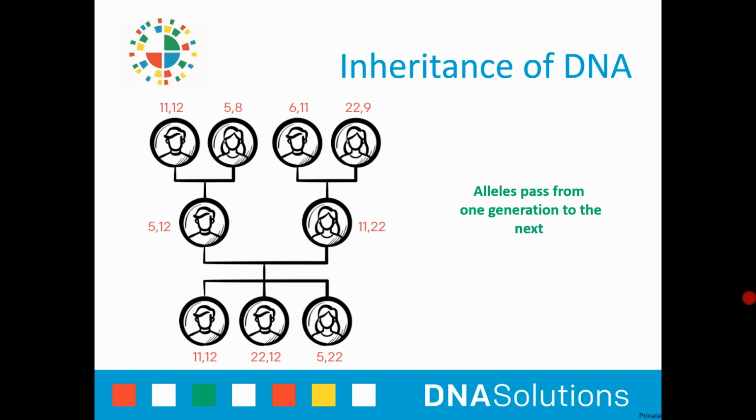This makes single generation testing relatively easy, and that's where paternity started. We call it paternity these days. It's relationship testing. Barring mutations, if you don't share one of these markers with your parent, that means they're not your parent. So you can exclude someone based on the fact that they don't share one of these size markers.